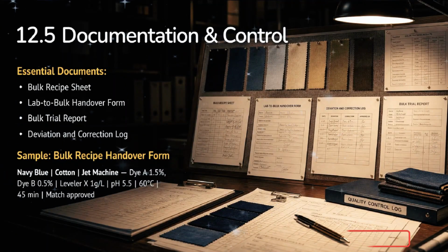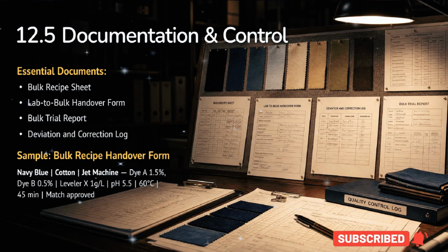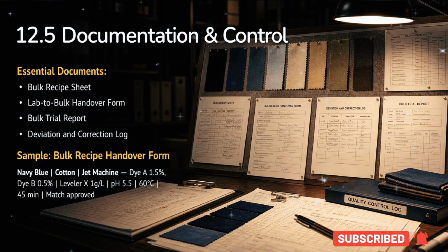Documentation and control are critical. Essential records include the bulk recipe sheet, the handover form, trial reports, and deviation logs. Maintaining these documents, like the sample handover form shown here, ensures every team member follows the approved parameters.